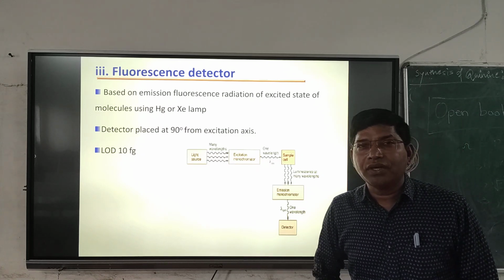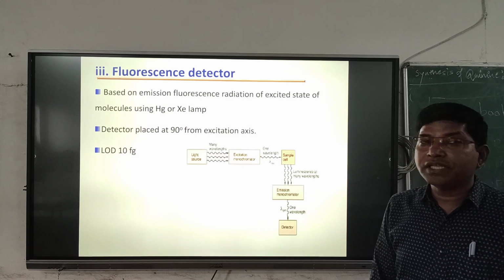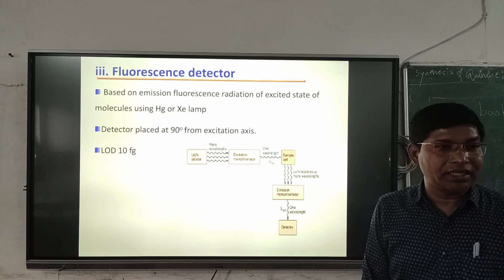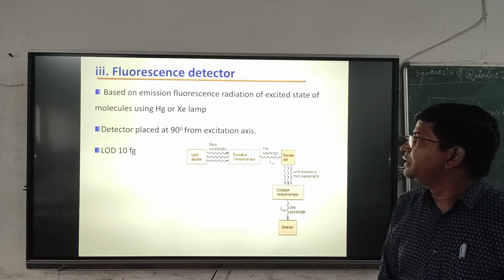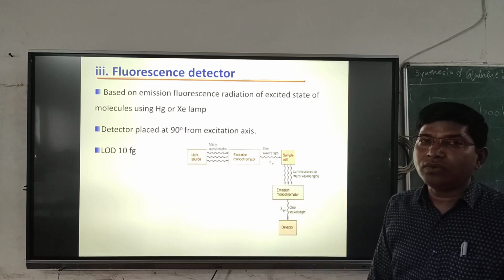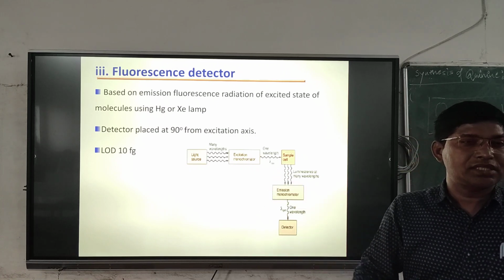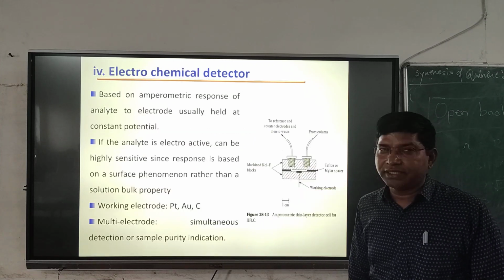And if your compound has a fluorescence property, we can detect those types of compounds. The particular compound will give off fluorescence light, and that will be detected by a fluorescence detector.